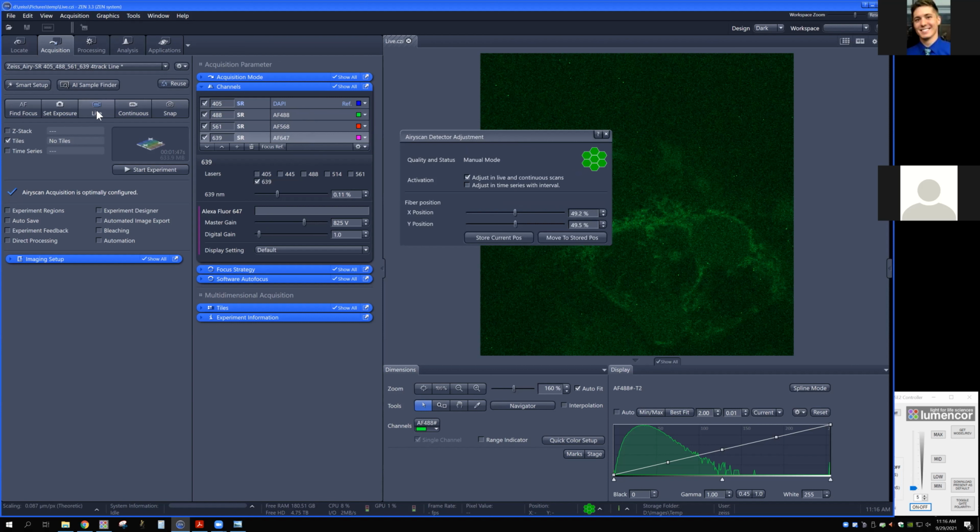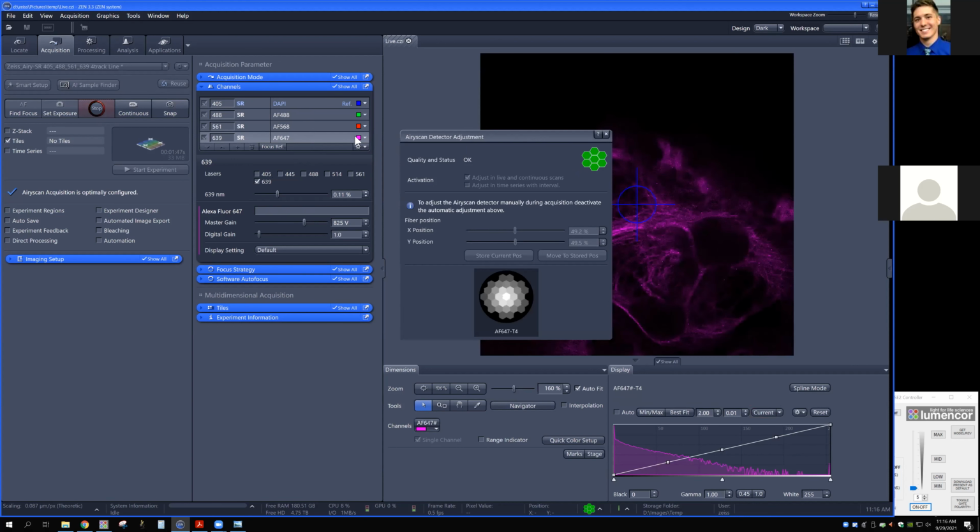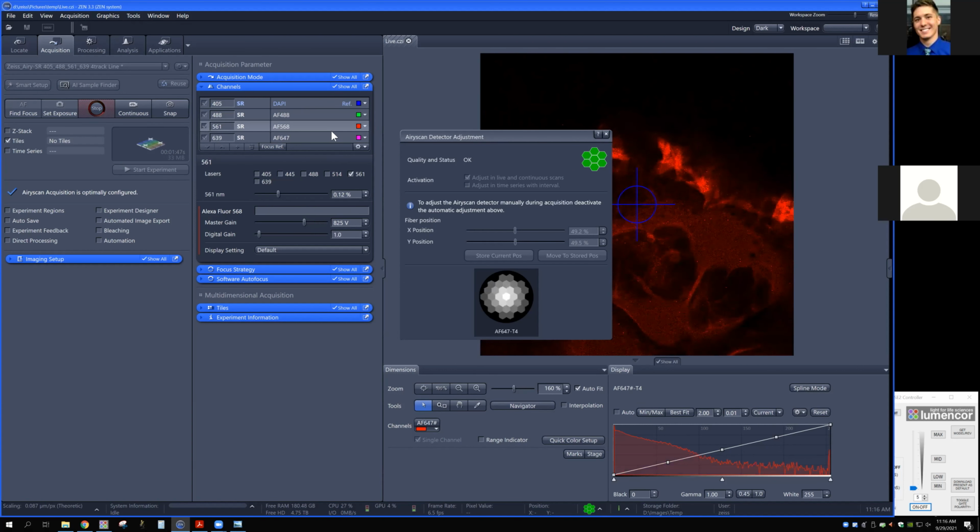And since I'm doing line switching, this voltage change is going to apply to everything. So PMT voltage is another thing that I can't change if I'm doing a line switch to go very quickly. So again, I can back off certainly on that power here too. Something maybe like that. It's going to be gorgeous. The red here, I'll still try collecting these anyway. Let's see what we get.